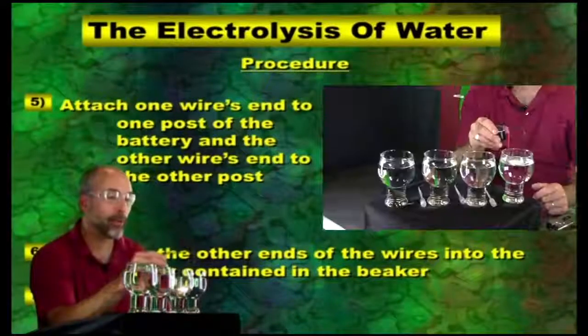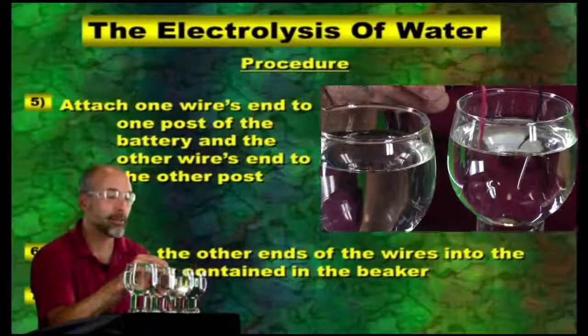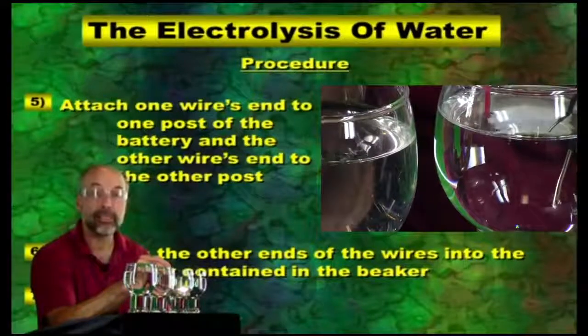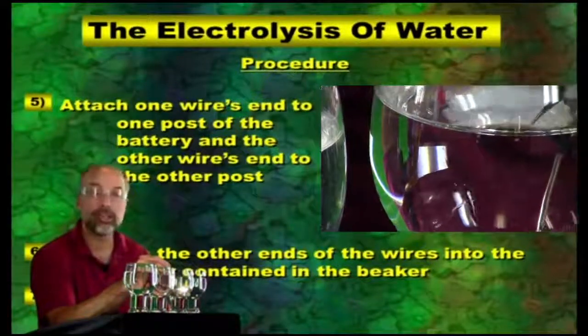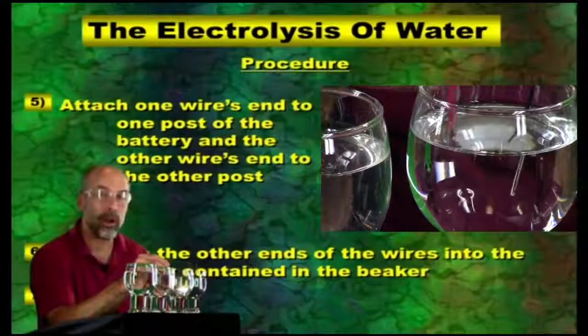So we'll go ahead and set this thing down, and we're going to stare at it, and stare at it, and stare at it. Now, as I'm looking at this thing, I am seeing no indication whatsoever that decomposition is actually taking place. If it were, I would be seeing bubbles emitting from the ends of these wires.